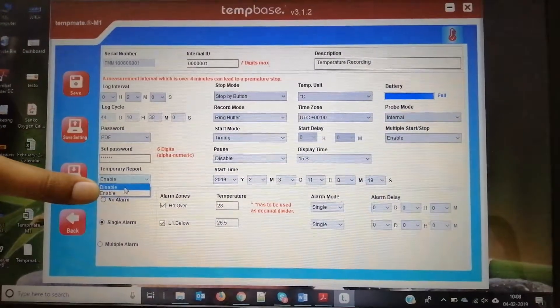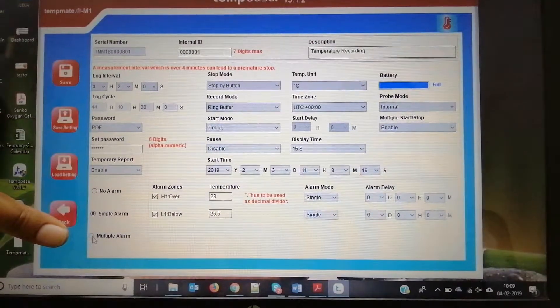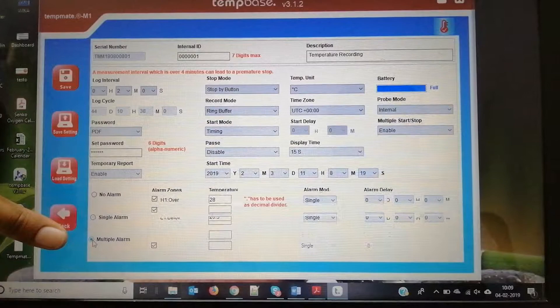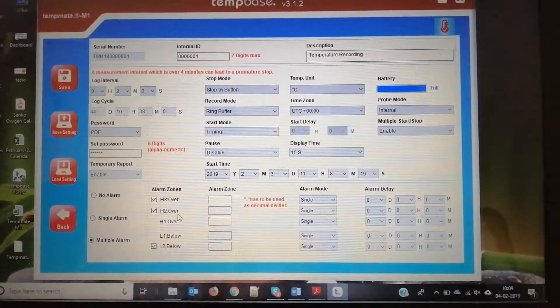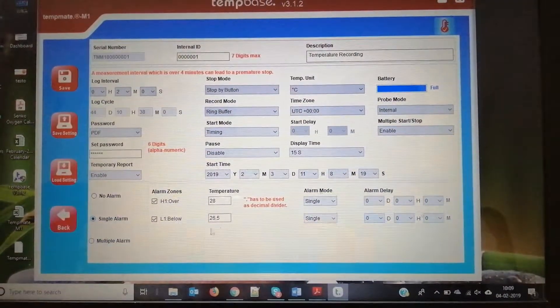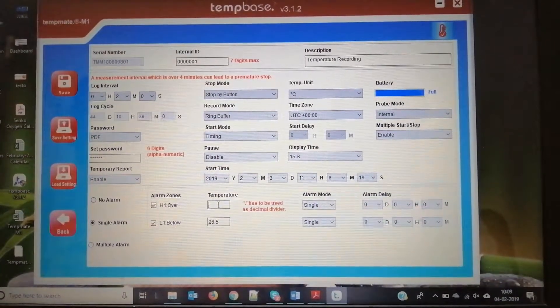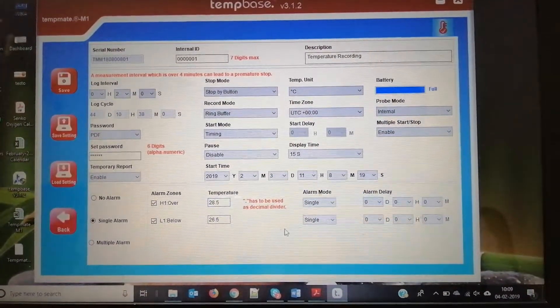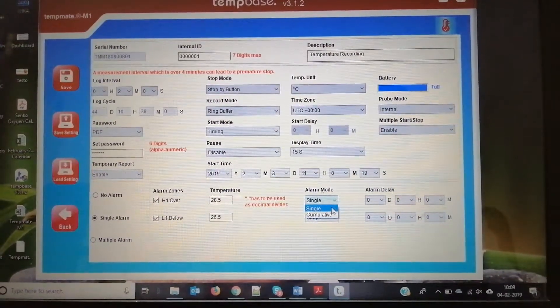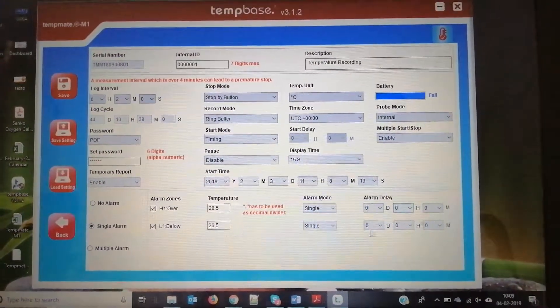This is the temporary report setting — if you connect the data logger to your PC and set this as enabled, a PDF will be automatically generated. If you set it to disabled, the PDF will not be generated. As previously mentioned, this device supports multiple thresholds and multiple alarms. You can set up to five alarms, and if you want a repeat alarm you can set it as single or cumulative. You can also set the alarm delay.